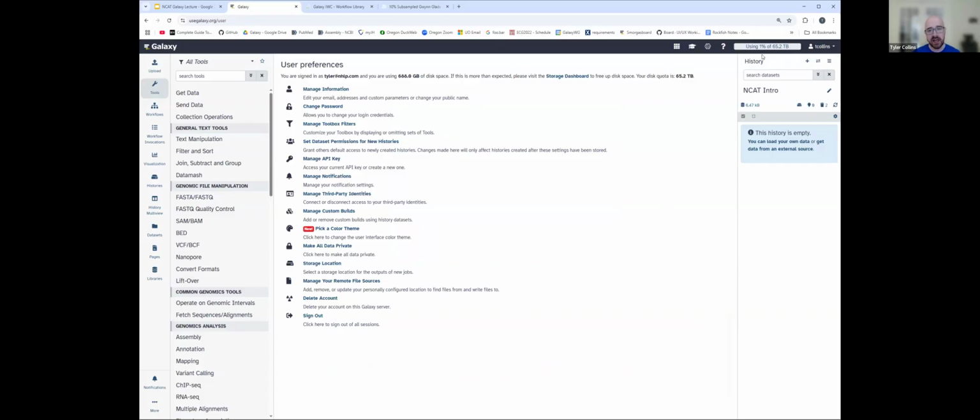And as well, in Galaxy, you'll have storage up here. By default, we provide all users for free 250 gigabytes of storage they can use forever, and then 1 terabyte of scratch storage that will free itself up after about a month of it being used. What exists in the scratch storage will remove itself, but 250 gigs will exist in perpetuity. But if you ever need more for a project or something specific, you can reach out to the help team. They can also often give you more storage.